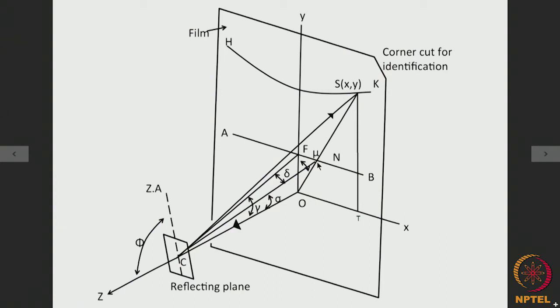So, this gamma will be the same for all the planes which have given rise to diffraction spots on this line. All the planes of the zone which give rise to the diffraction spots on this particular hyperbola, their plane normals will be tilted by an angle gamma from this line, and for this particular spot the value of delta is here, for another spot over here the value of delta will be on this side, etc., etc.